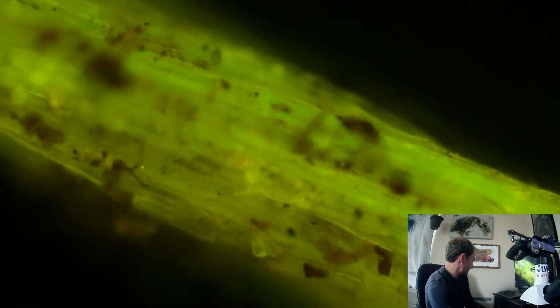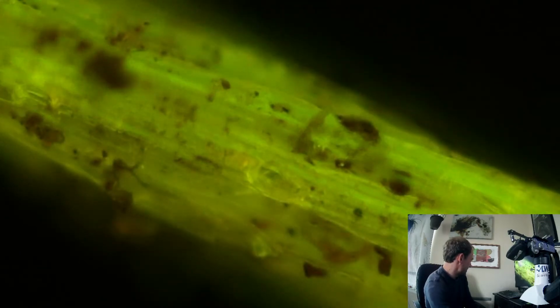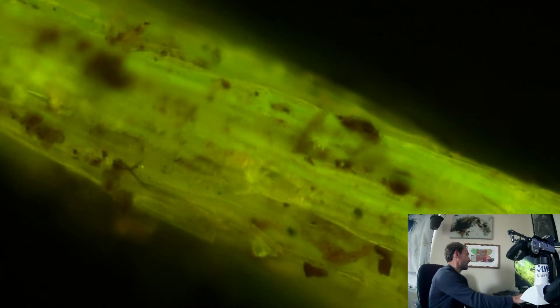Oh yeah, I'm seeing some. Right there is definitely fungal hyphae. Splitting. One's going this way, one's coming up this way.